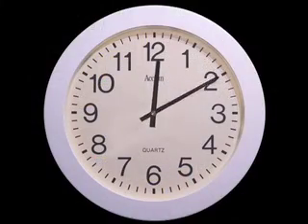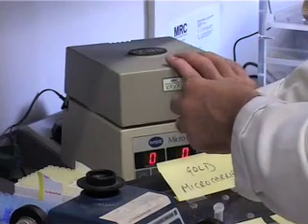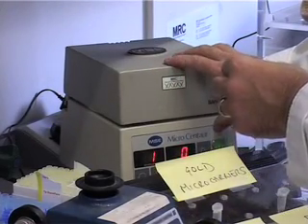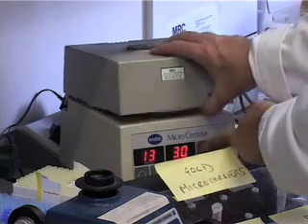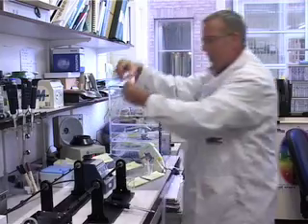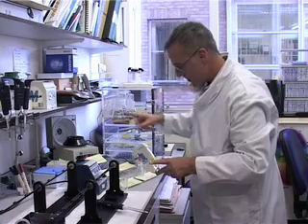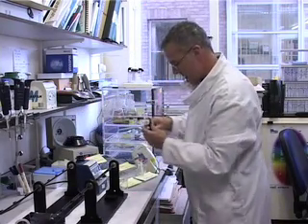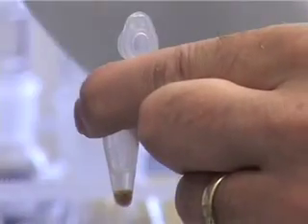After 10 minutes, the tube is given a pulse spin to bring down the gold as a pellet. Next, the supernatant needs to be removed. To estimate the efficiency of coating the gold with DNA, a sample of the supernatant can be examined by running it in an agarose gel.